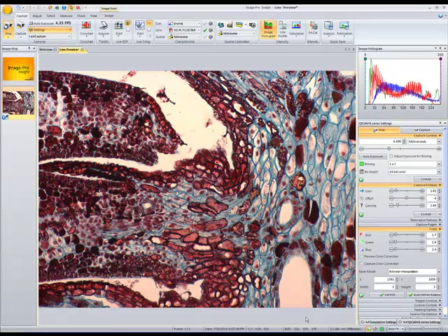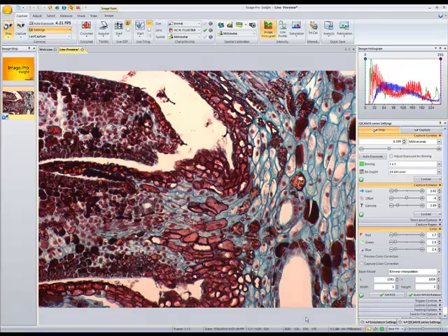This tutorial will show the line profile and histogram tools in ImagePro Insight.